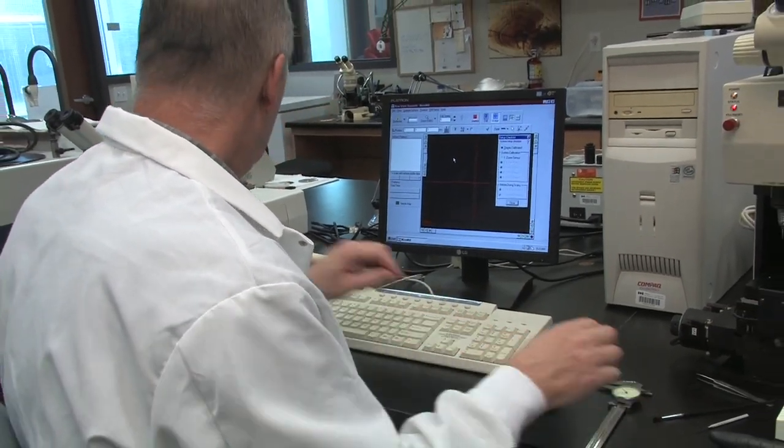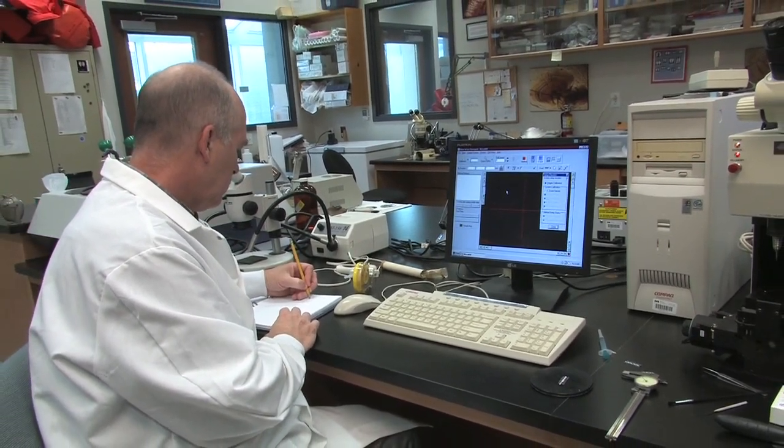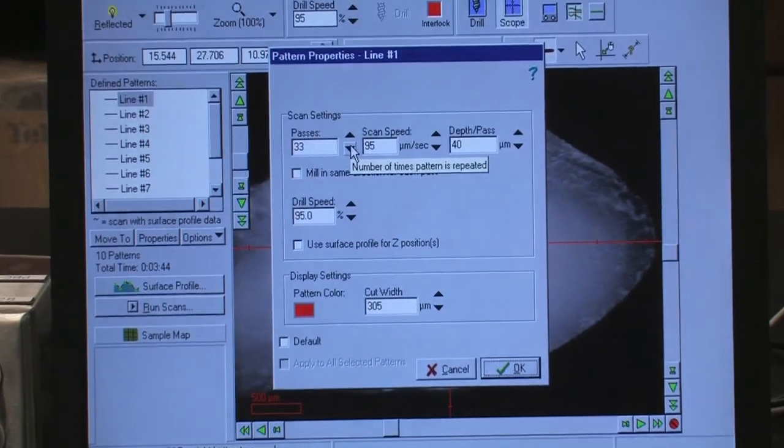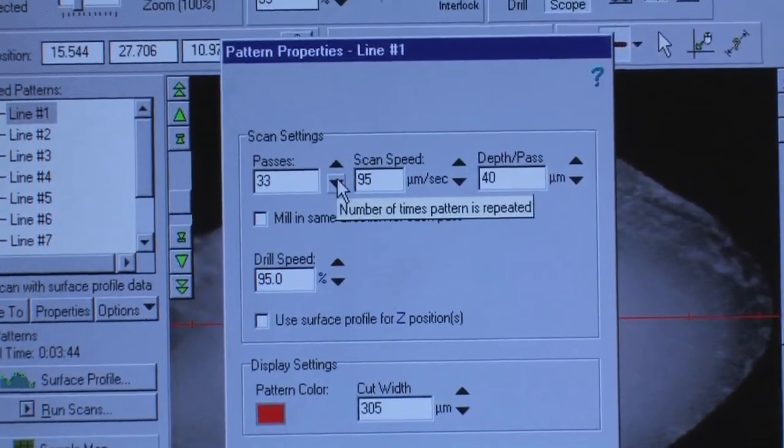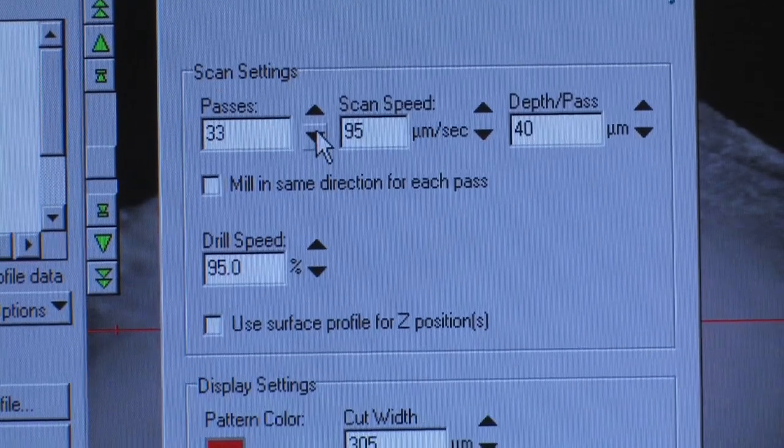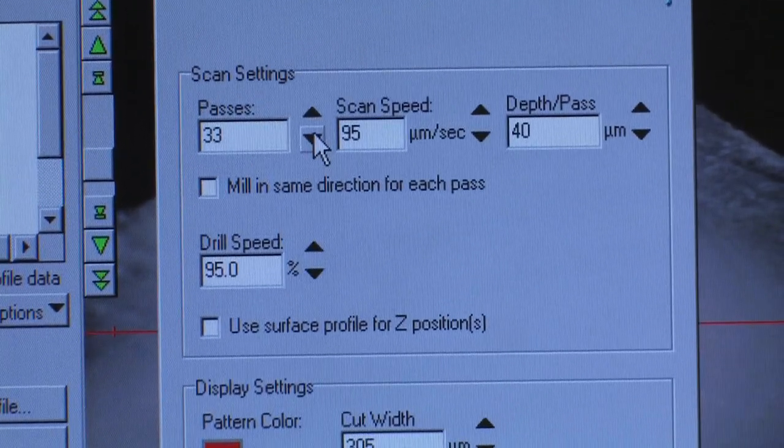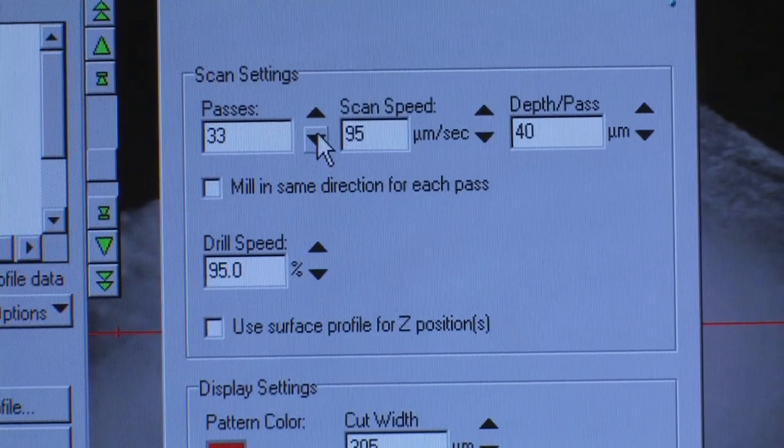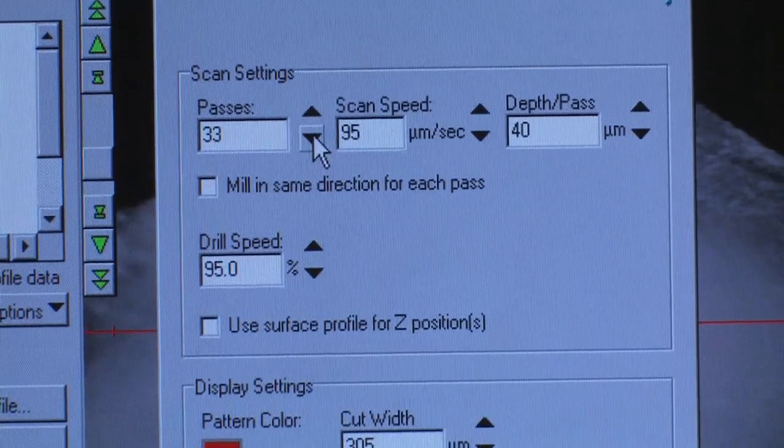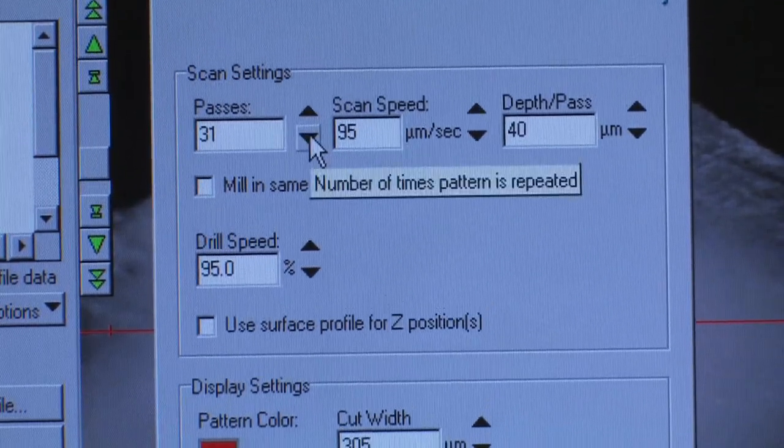Record the settings you're using so you can modify them if your practice sections break. For example, if your sample is one millimeter thick or a thousand microns, drilling at 30 microns depth per pass would mean you would need a total of 33 passes of the drill to completely drill through the sample. Make the total number of the passes one or two less than your estimated number to stop the drill from drilling into the sample plate. For the example mentioned, you would set the number of passes to 31 or 32.